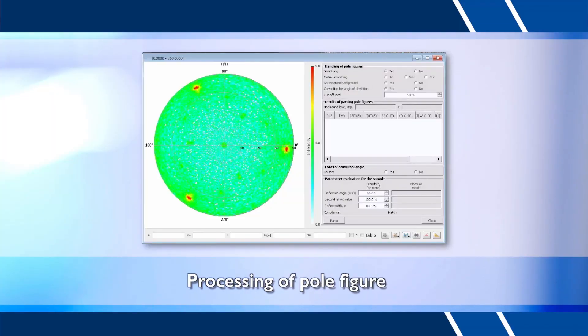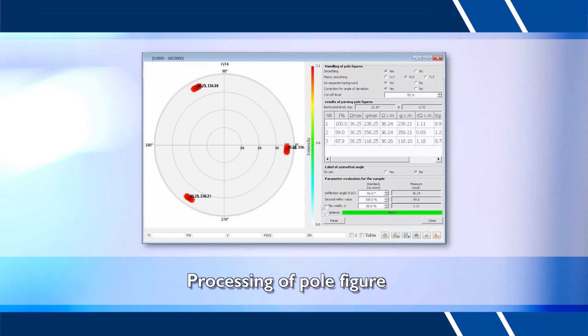Measured diffraction pattern is processed directly within the software for data collection.